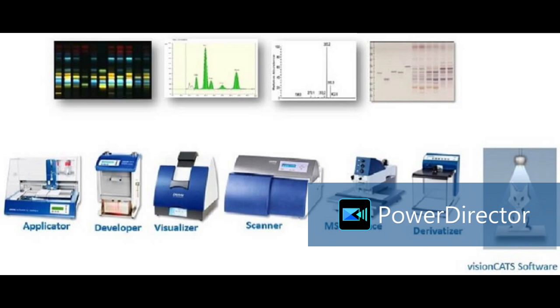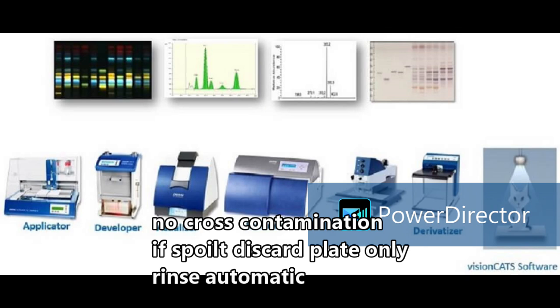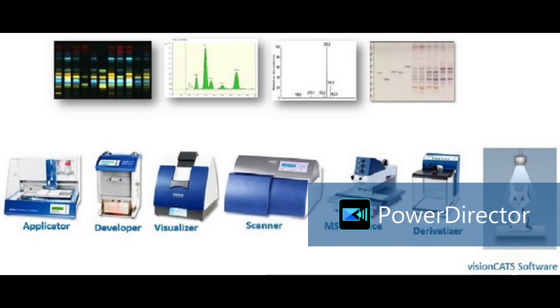If something happens after application, we can find out exactly what happened, whether bands are applied properly or not. If not applied properly, discard the plate, prepare the sample again with additional steps, and apply it on a plate again. So you can stop anywhere and start the complete run again. That is possible.